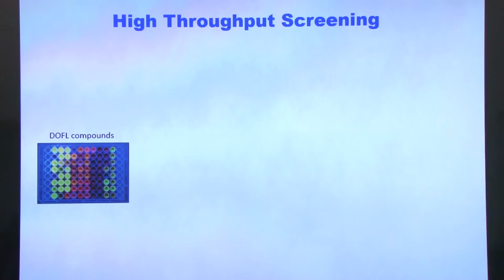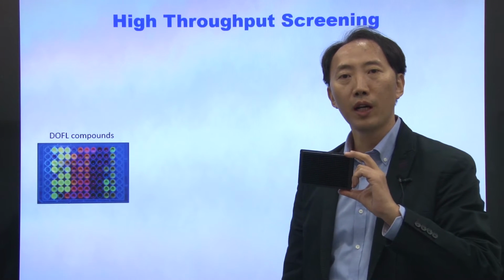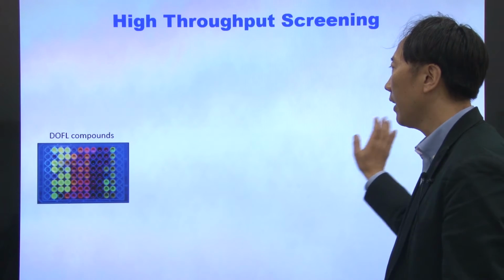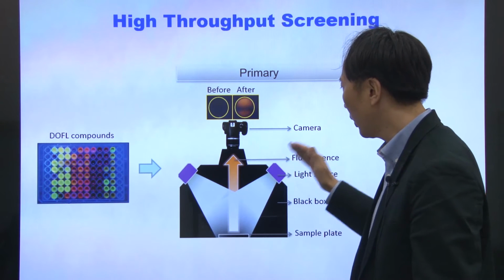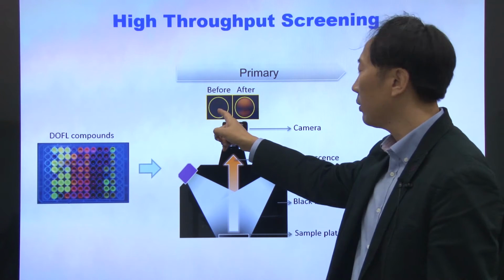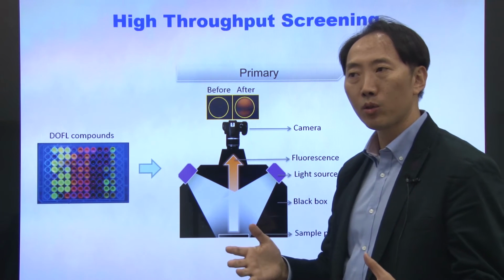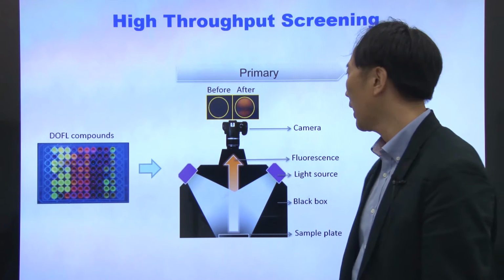And let me show you one plate. This size of plate can be 96 or 384 well plate. And using this kind of plate, we can accelerate those screenings. And then maybe this kind of a chip box. This is the black box with a UV lamp on top. And then you can put the camera on top. Then it's a very easy screening system. Then this is without your target. And this is with your target. And then you can take pictures and compare those two pictures in Photoshop program. Then you can find the proper sensors very quickly.